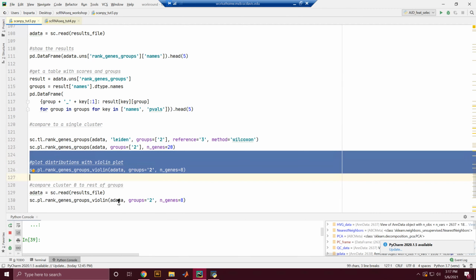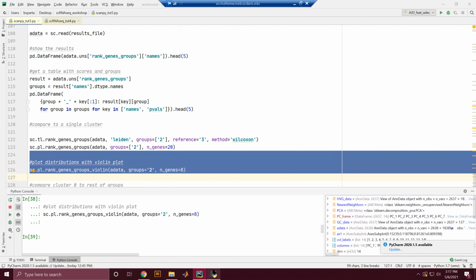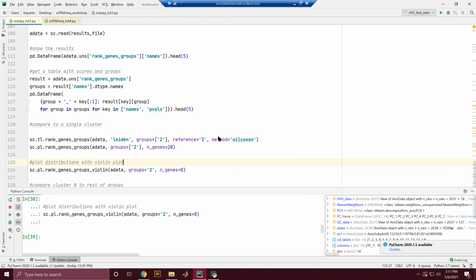Appears to be missing. Interesting. Oh no, I can't see the chat again. Would you be able to ask the question using your microphone, or should I stop my share? I ran that code and it threw an error. Which I'm just copying. It said key error Leiden.